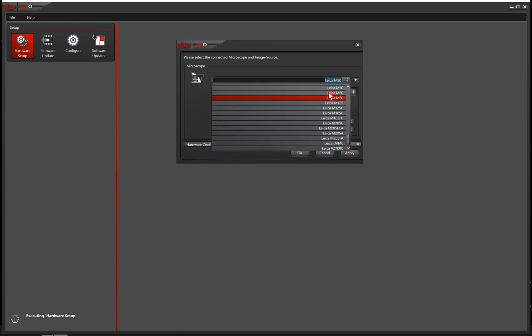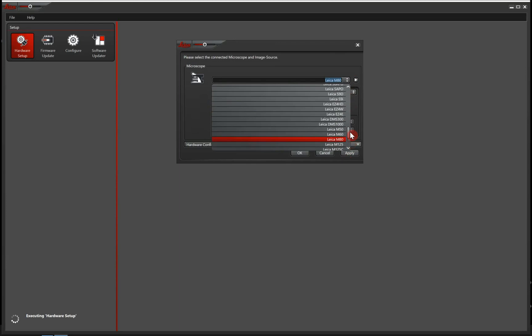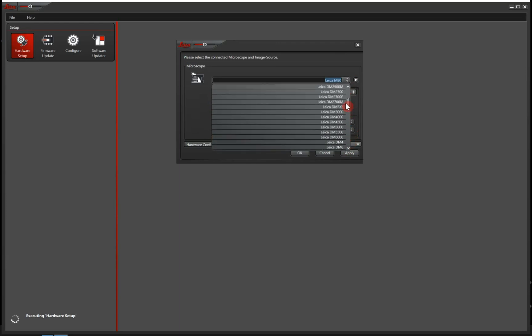In this case, we can just use the Leica M80. If your microscope isn't in this list, then you can also configure a generic stereo microscope.